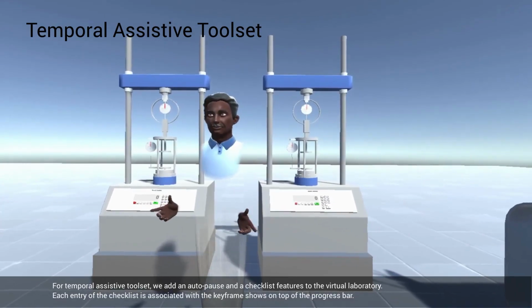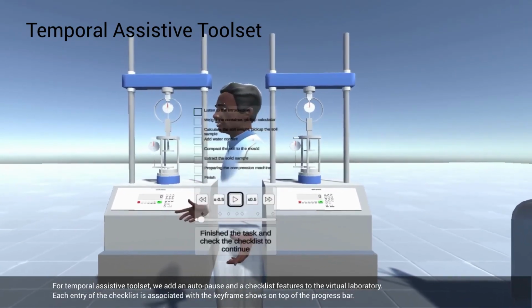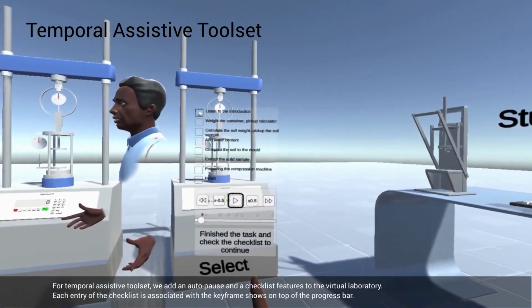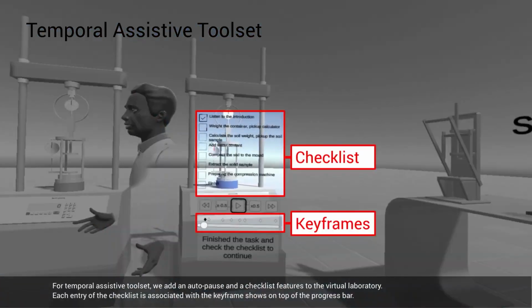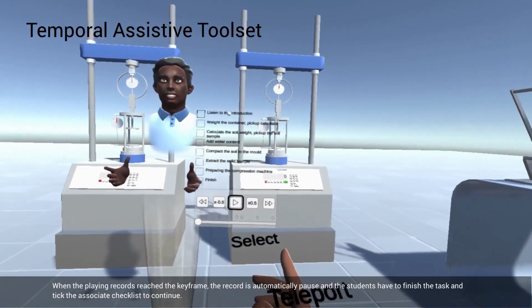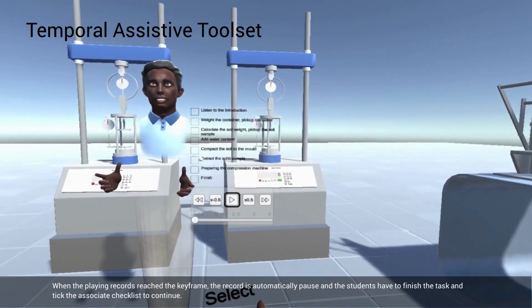For the temporal assistive toolset, we add autopause and checklist features to the virtual laboratory. Each entry of the checklist is associated with a keyframe shown on top of the progress bar. When the playing record reaches the keyframe, the record is automatically paused, and the students have to finish the task and tick the associated checklist item to continue.